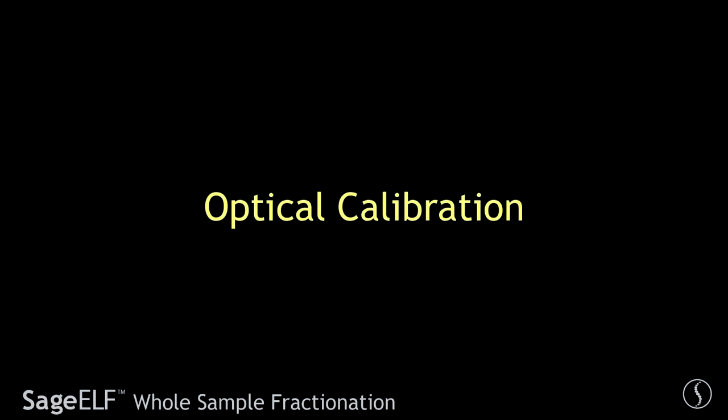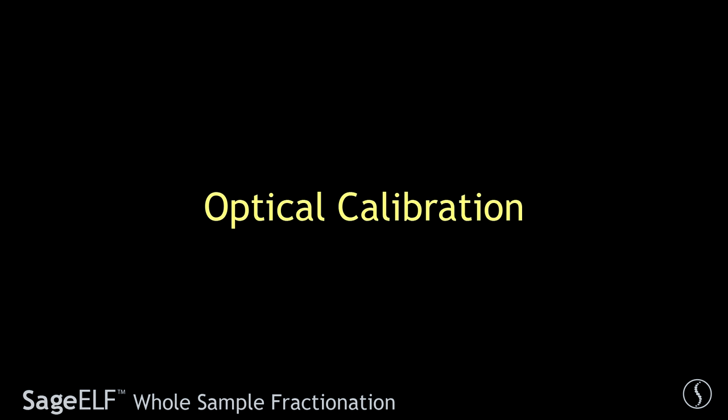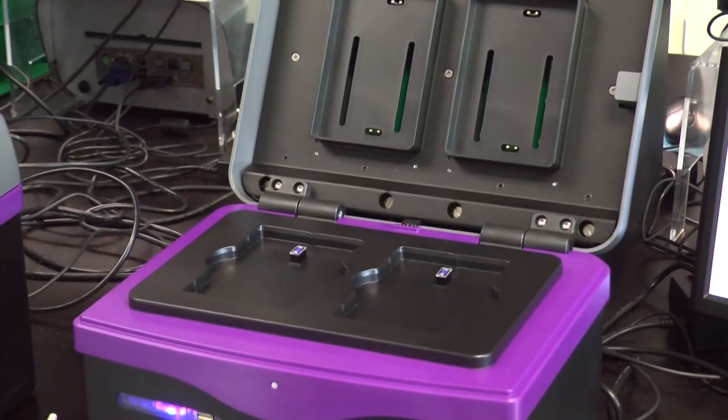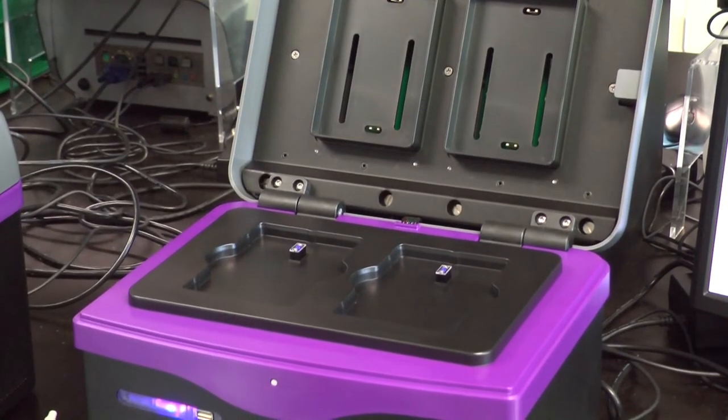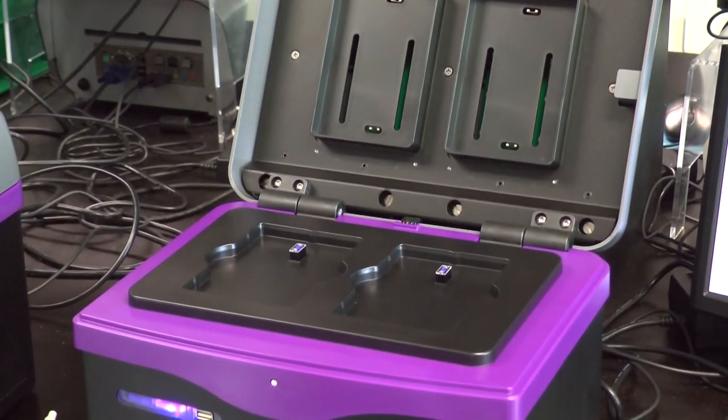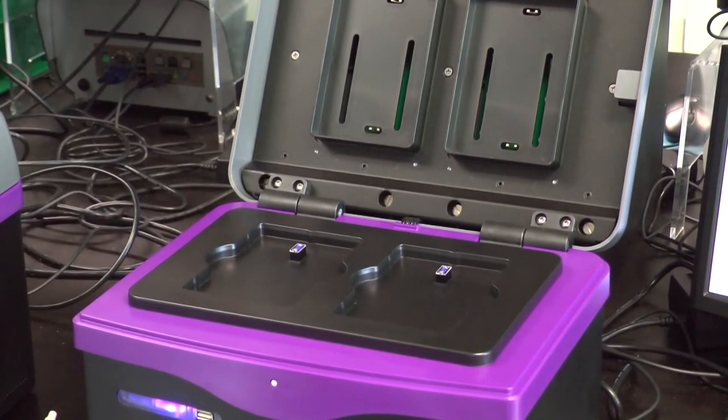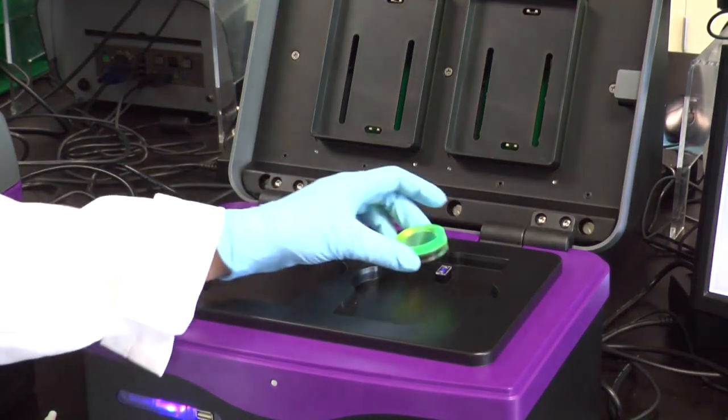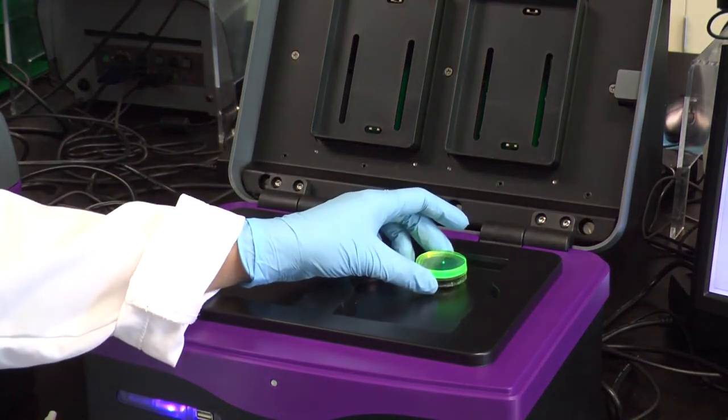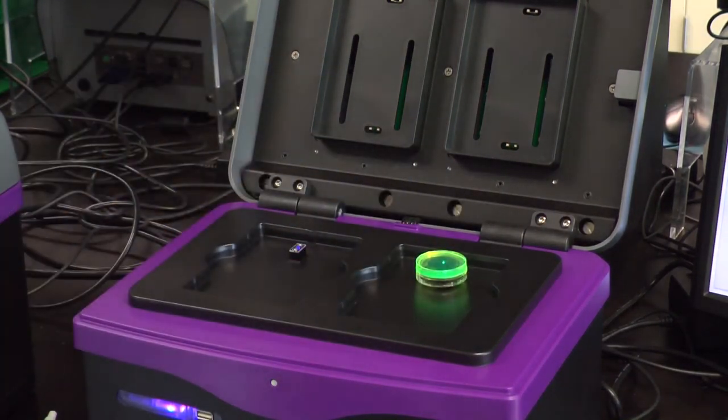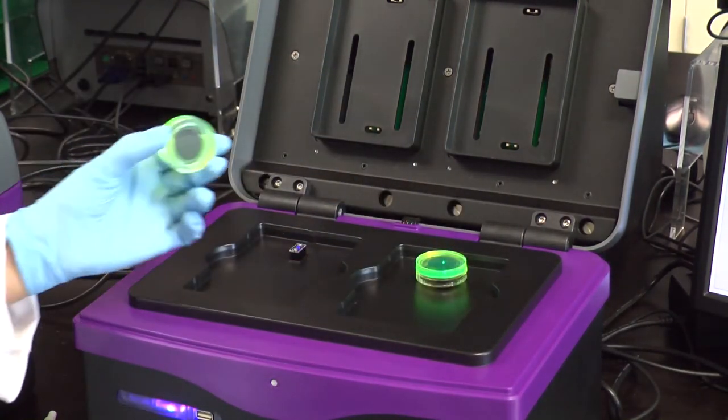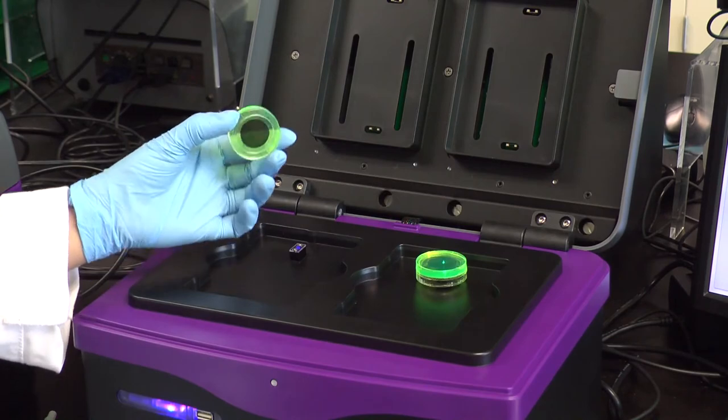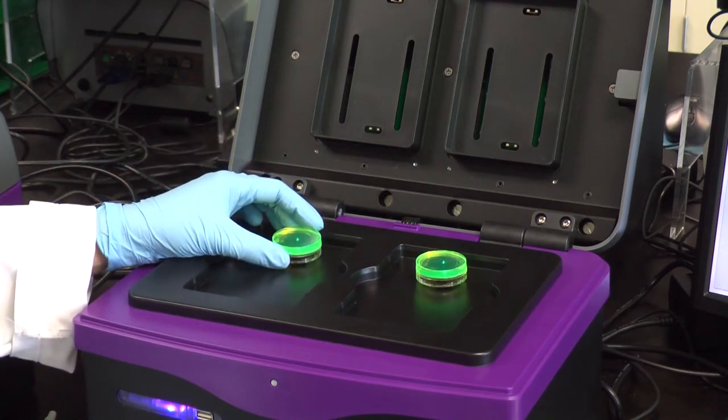When running samples with internal standards, the optical device on the Sage Elf should be calibrated before a run. Two green optical calibration fixtures are provided with the instrument.